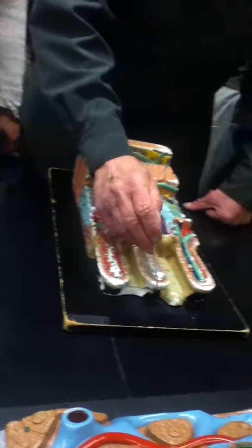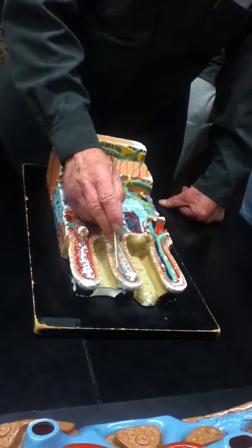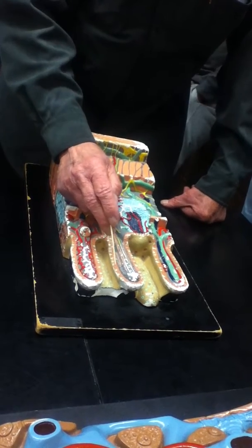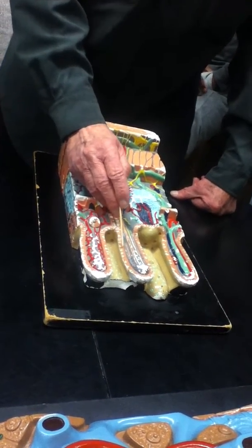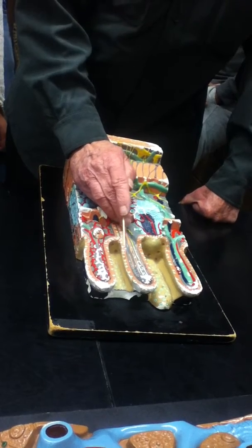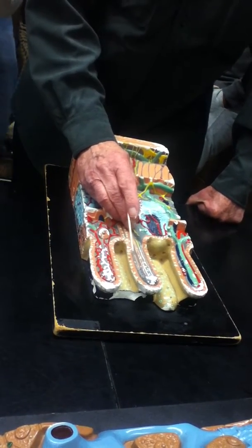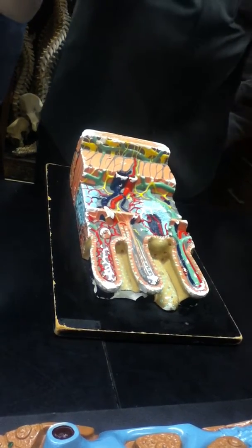We can see that the villi are lined by these columnar epithelial cells, and the little blue jobs amongst them are known as mucus glands. They have another name too. What name do I have over there? Paneth? Not Paneth. Goblet? Goblet. Because under the microscope, they kind of look like a wine glass. So they're called goblet cells.